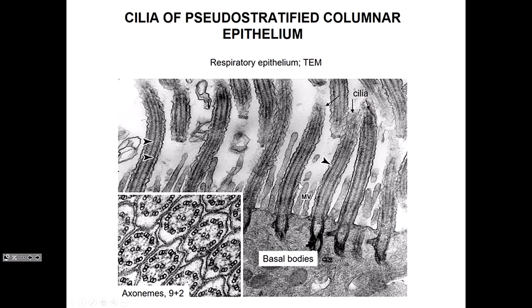And you can see these true cilia. You can kind of see longitudinal sections through these microtubules here, next to a microvillus, which is filled with actin, which doesn't really show up anywhere near as clearly as the microtubules of the true cilia. So the fact that you can see microvilli adjacent to cilia helps you to identify one or the other in comparison, because you kind of know what's in the middle of these. Any questions?